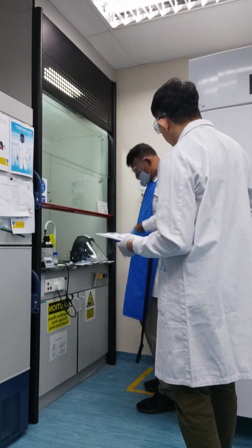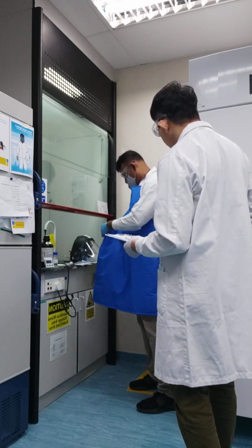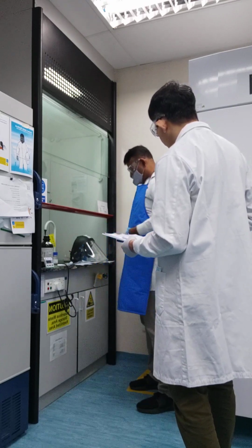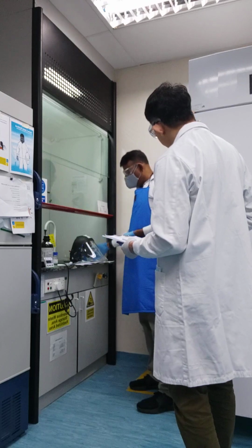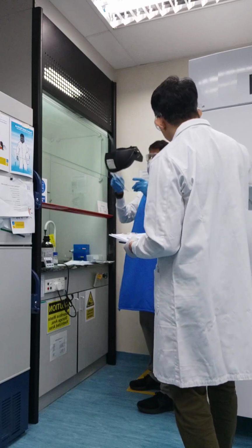First we are wearing this chemical apron. You also need to protect your face and eyes, so you are putting on a face shield.